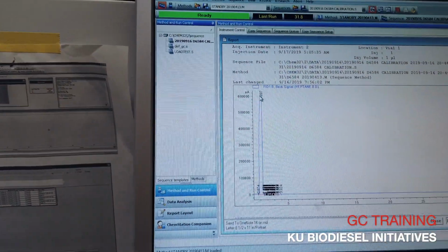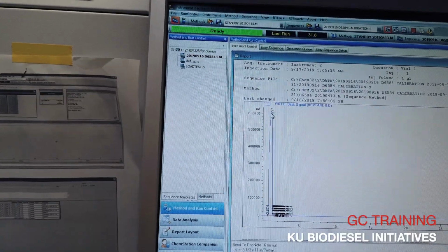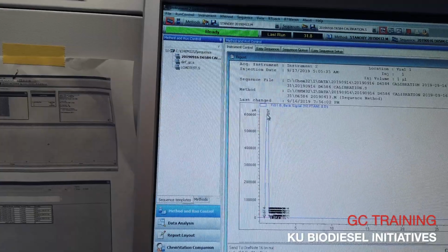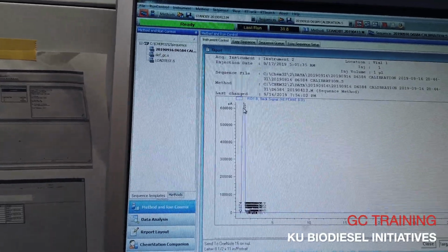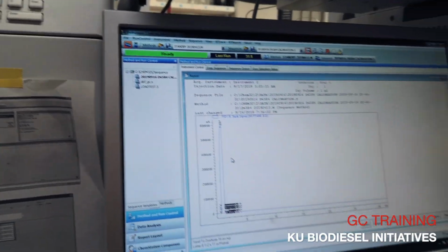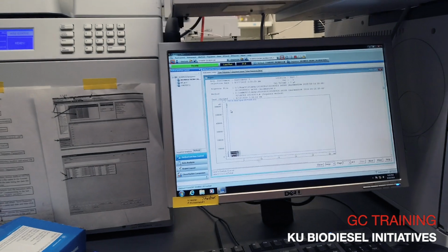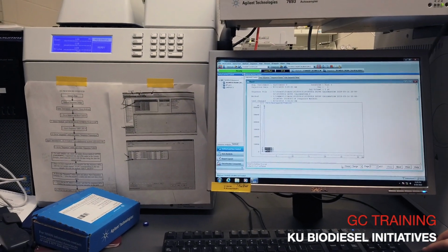and then you'll get an electrical signal that is basically equal to the amount of stuff that you're going to have in here. So since it's solvent, it's going to expand a lot and it'll basically saturate the detector. So that's why you want it to be so tall.